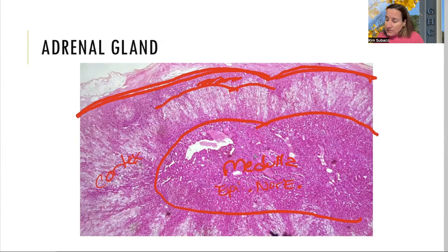The next zone is this, I hope we can kind of make it out, this kind of lighter zone on the cortex, the lighter zone. You may be hearing my dog snoring too in the background. I'm sorry, she's loud. She's a snorer.